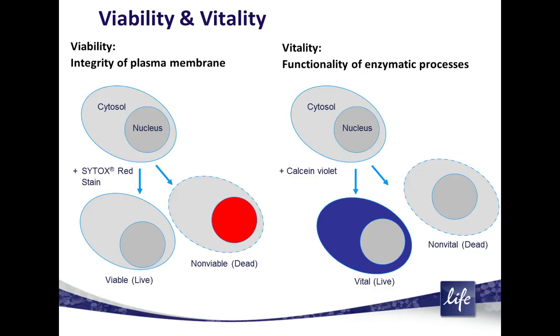So viability and vitality are principally used to enumerate the proportion of live and dead cells within a population. The diversity of live cells within their environment makes it difficult to devise a single assay that is applicable to all cell types.